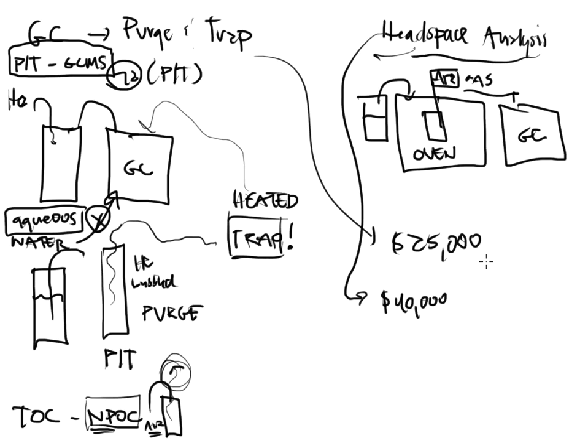For instance, if you go to a car lot, do you get one with cloth or do you get one with leather? The same type of thing happens here with all of our equipment. What are the bells and whistles associated with this instrument? Well, ours was around 40 grand that we sunk into this. So that is an attachment onto a GC that we have in the lab.